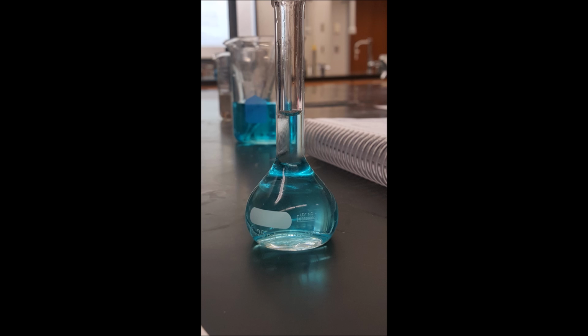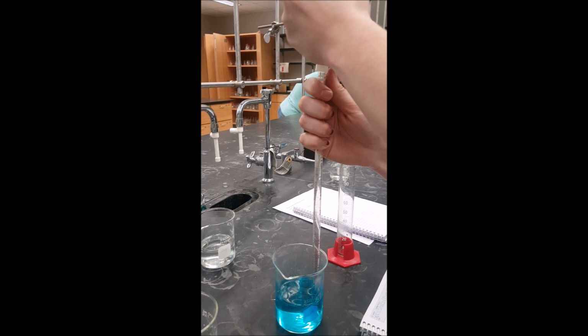Once you've done that, you can take your pipette and bulb and squeeze your bulb, place it on top of the pipette, and release your hand with the thumb close to the top and draw stock solution into the pipette. Get your stock solution as close to 1 as you can.